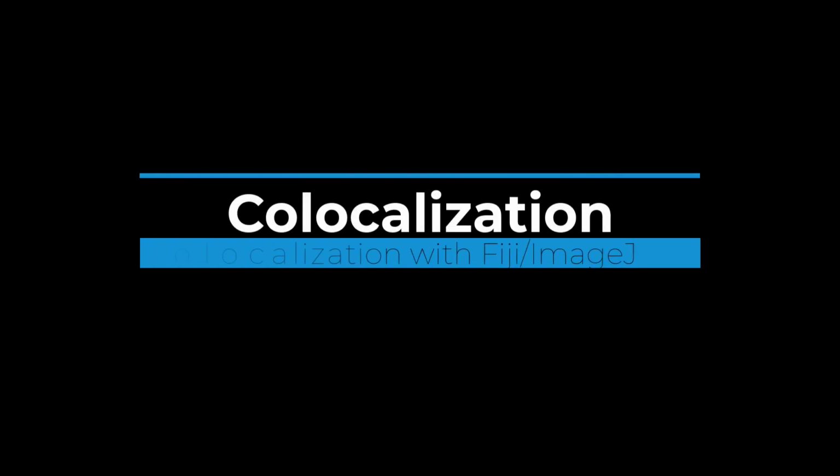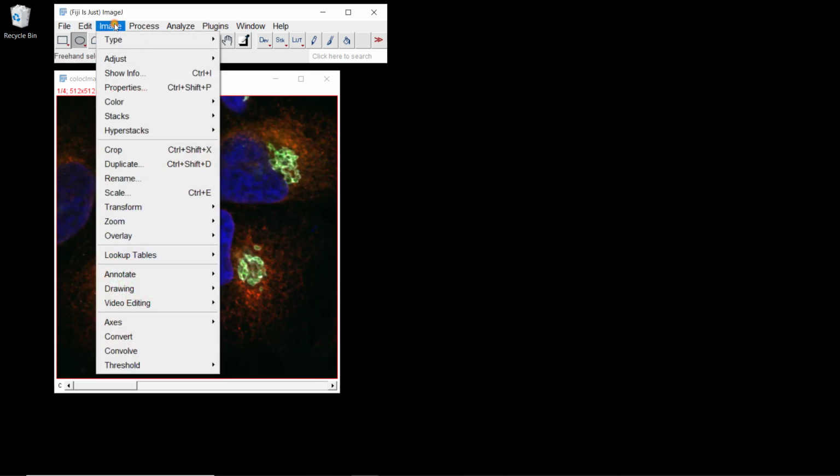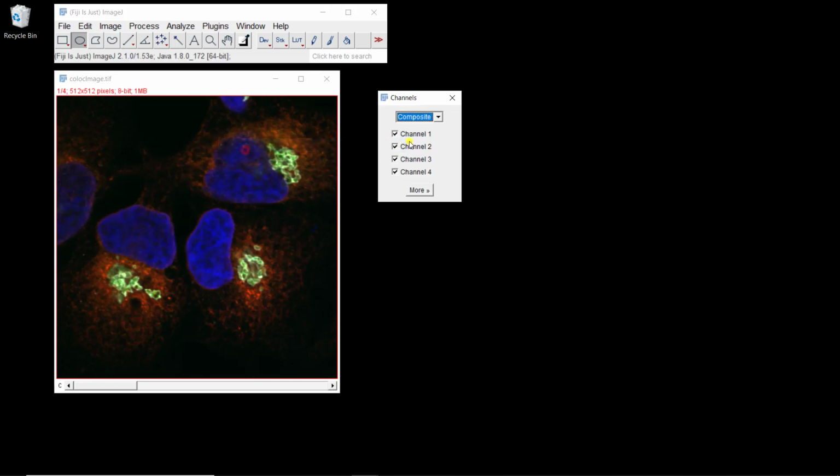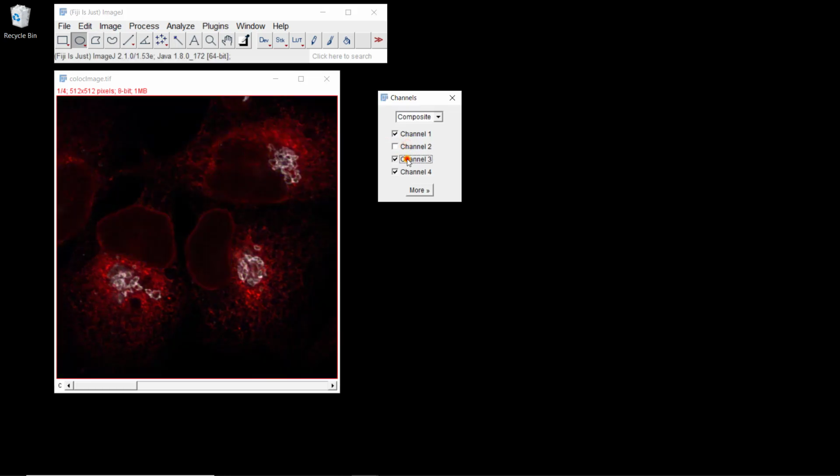In this video, we're gonna see how we can do a colocalization study with ImageJ. So for this study, we're gonna focus on this image. Let me open the channels tool, and I'm gonna just switch off everything but the first channel.